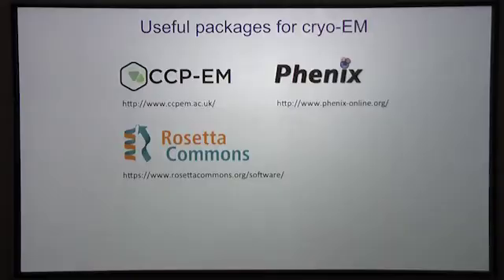My talk will pretty much follow these 3 steps sequentially, but in real life, where some of us live, these 3 steps are interrelated and often happen simultaneously. Because there's a limited amount of time, I'll really just focus on tools that are available from these 3 packages: CCP-EM, Phenix, and Rosetta. There are lots of other good tools out there, but the ones concentrated in these packages are very good.